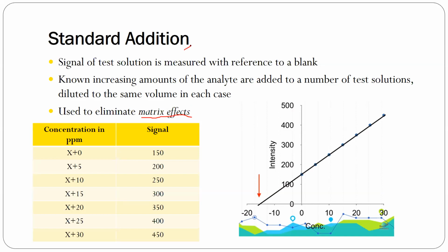So in the standard addition method, ang pinagkaiba dun sa calibration curve method, di ba kanina, meron kang standards, meron kang signal. Yung standards, known yun. Ngayon naman, ganito ang gagawin. You start with the unknown and measure the signal. Now, that unknown solution, you will add known amount, which is in here in this example, 5 ppm, measure the signal, and then add another 5 ppm, measure the signal, and then add ka lang ng add. Okay, so lahat ng row na to, puro may unknown. Okay? Iba-iba nga lang nung in-add na analyte na known. So yung ina-add mong analyte, ang tawag dun spike. Okay? So what you do is to take the plot and for you to be able to get the concentration, extrapolate direct here. So yung linear plot na yan, kung ano yung nagko-cross ng x-axis, siya na yung concentration.